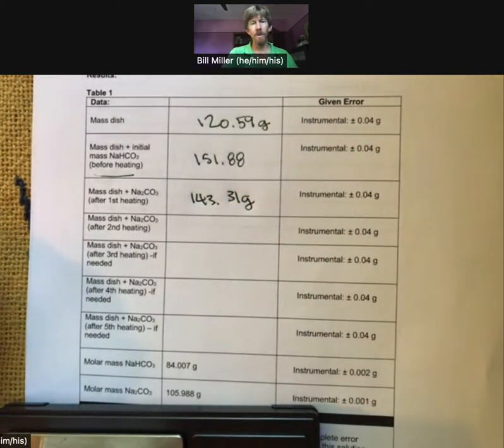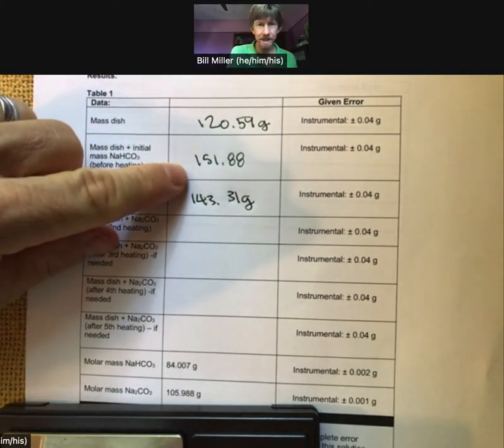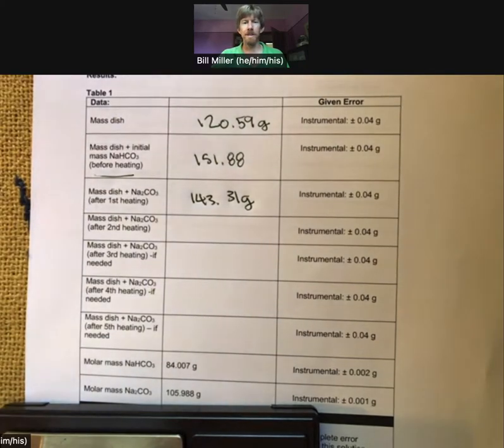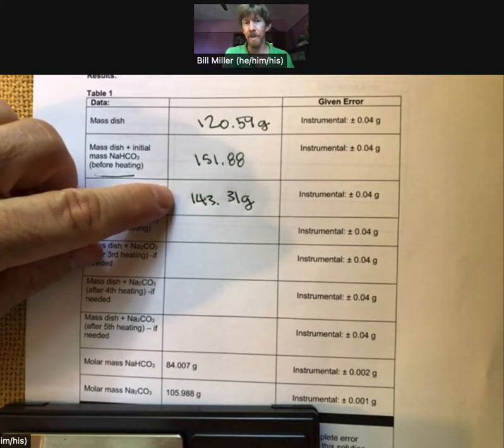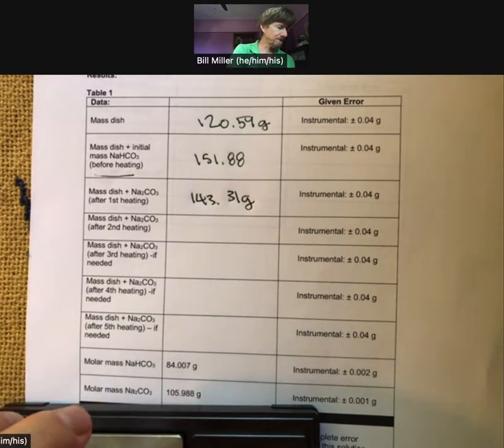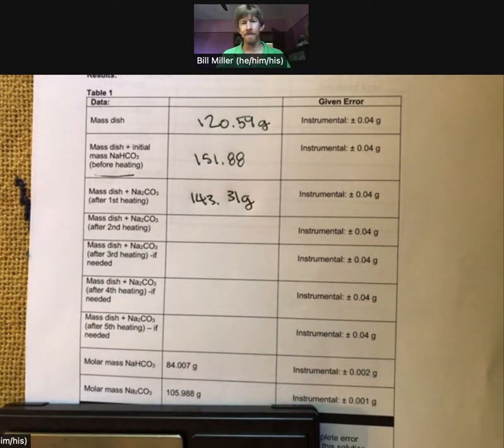And now what we'll do is we'll put it back in. So clearly we've seen some change here. To heat it to constant weight, we heat it. Now I'm going to heat it for 30 minutes. Then I'm going to come back and wait again. Let it cool. Wait again. And then we'll see if they are within the 0.05 grams.